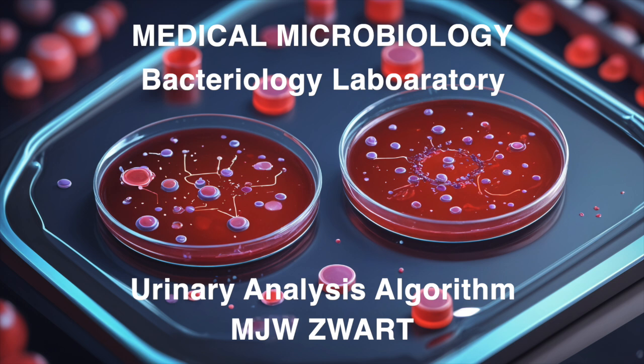It sounds like the Dutch protocol takes a pretty selective approach to this. No need to throw everything but the kitchen sink at every sample. They really emphasize choosing agar plates based on those initial findings from the Q-score and Gram stain. For example, if your Gram stain shows Gram-negative rods and you suspect a UTI, MacConkey agar would be a good choice.